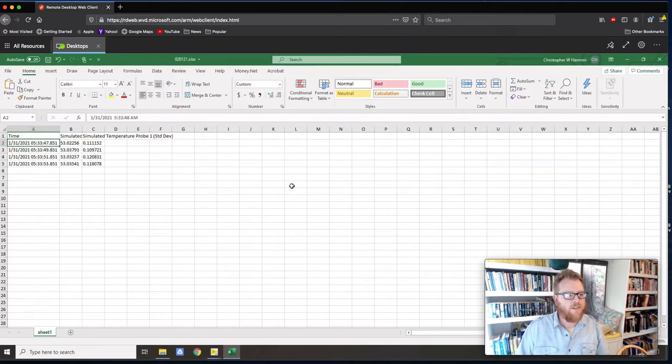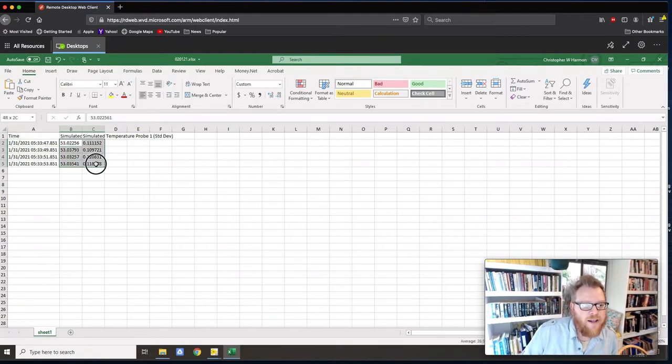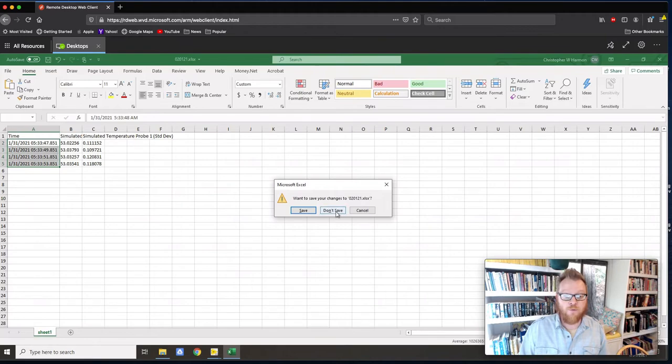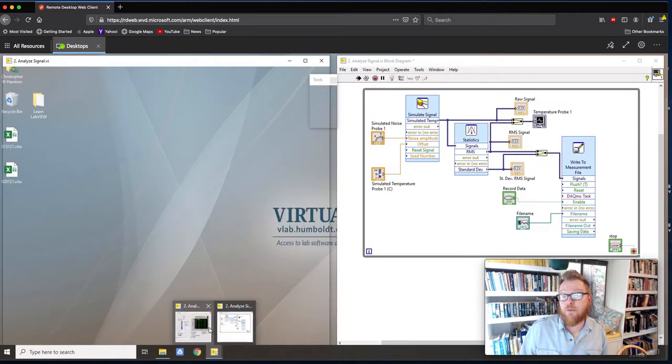And of course, the timestamp is still showing 013121 because it's not actually February 1st any longer. But all the same, this is a great way that we can use those computational skills to keep track of not only our data itself, so this would be the actual temperature, but this also helps me keep track of the metadata. So in other words, the date and timestamps. Okay, that's super important, especially if you're doing experiments for several months or even several years.